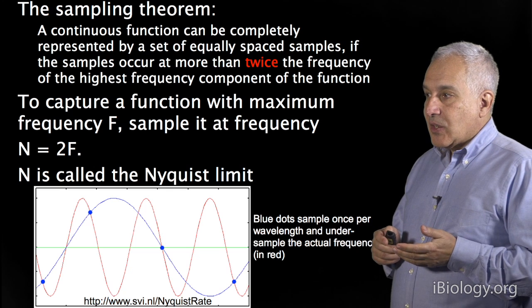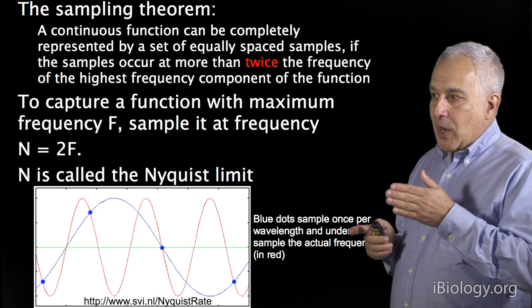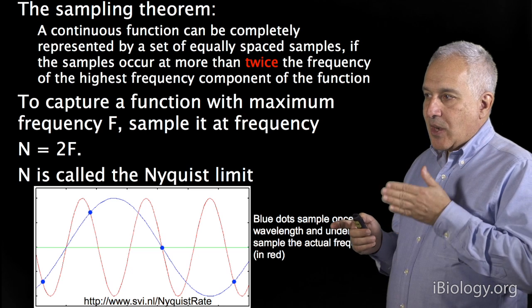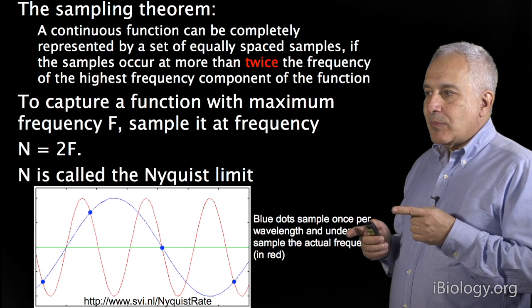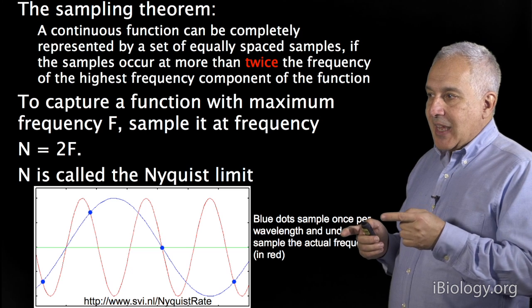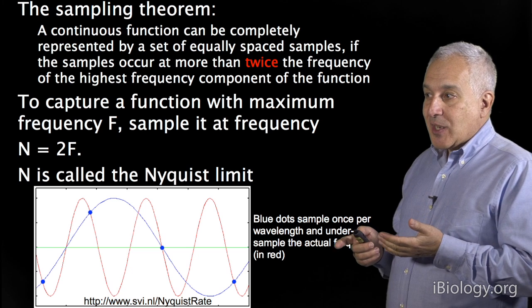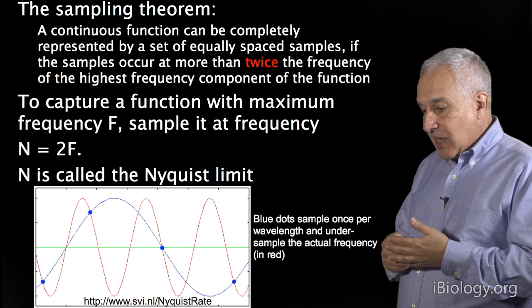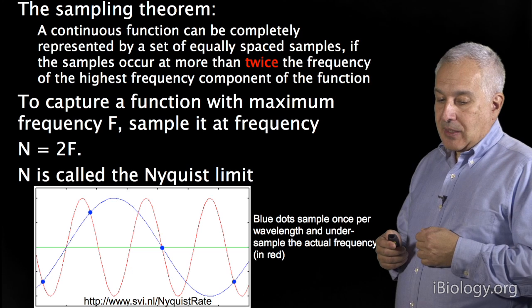And the reason aliasing occurs is shown in this bottom diagram. So if you have a sinusoid, let's say zebra stripes that are bright and dark, that's that red line. So it's an oscillation between bright and dark, but you're only sampling once per wavelength here, so you only get one sample for every peak and trough. You're going to end up with a sinusoid, in this case, that's got half, it goes from light to dark, but it has half the actual frequency of the original data. And the aliasing generates these kind of nice patterns that are just total artifacts of subsampling the data.